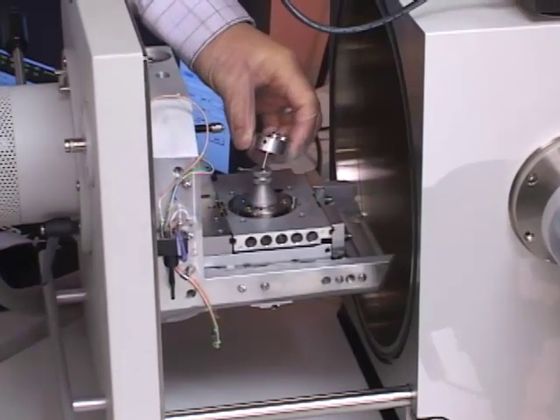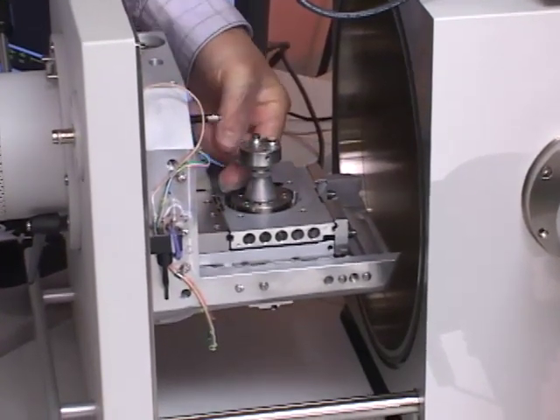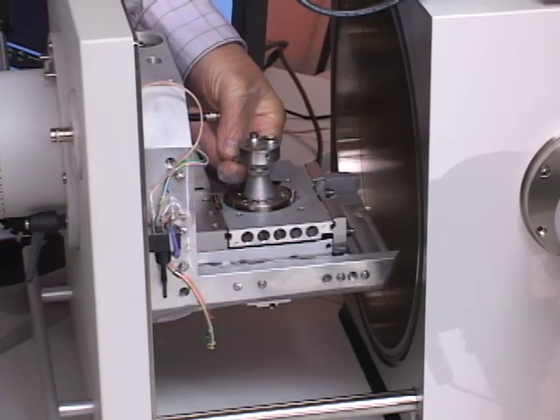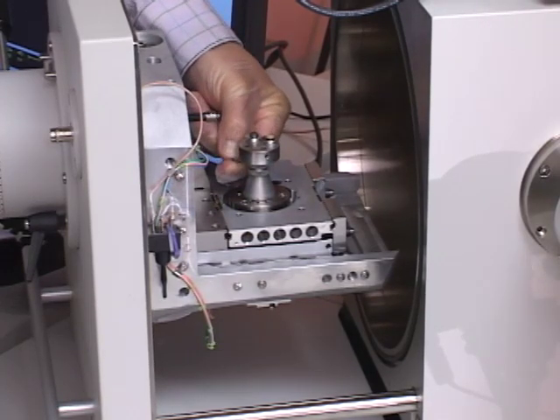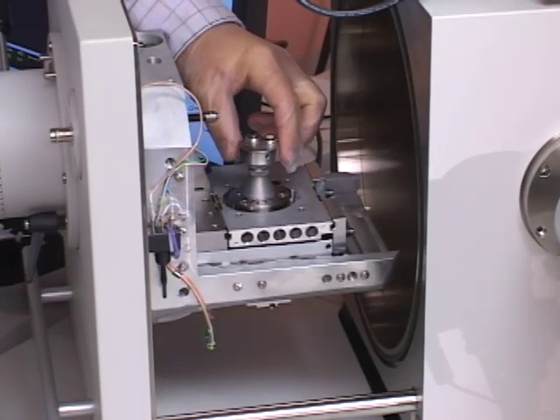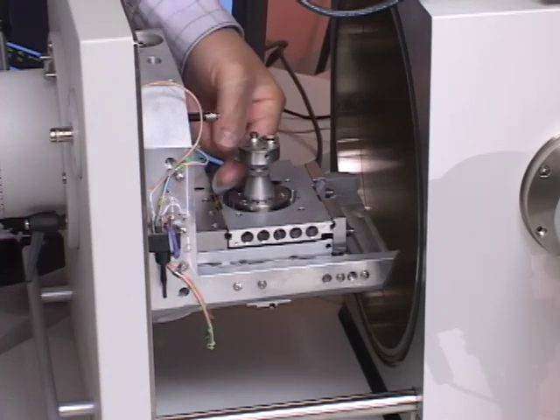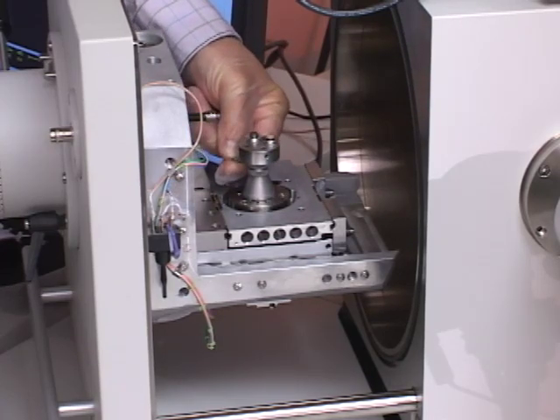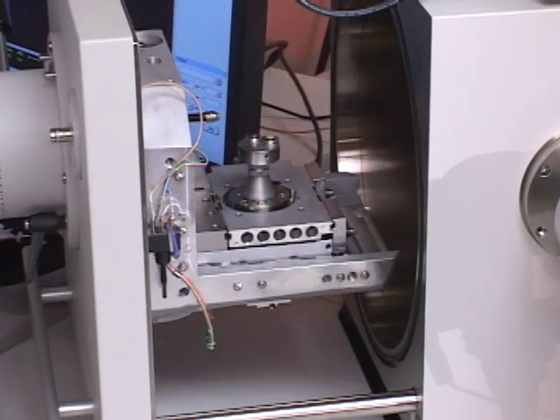I'm going to put the pin into the hole in the stage, and then there's a set screw on the side of this that I can tighten just with my fingers. And that keeps the holder stationary so that there's no vibration, and it also acts to ground the sample.